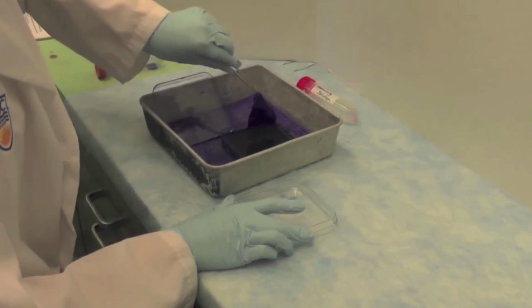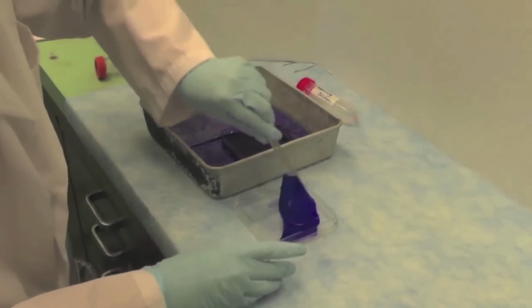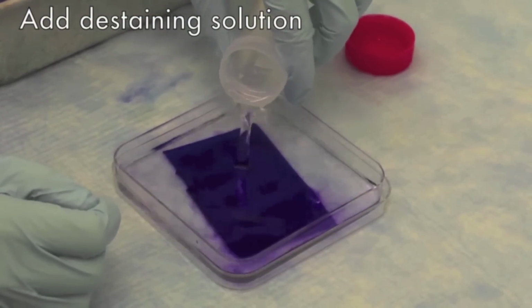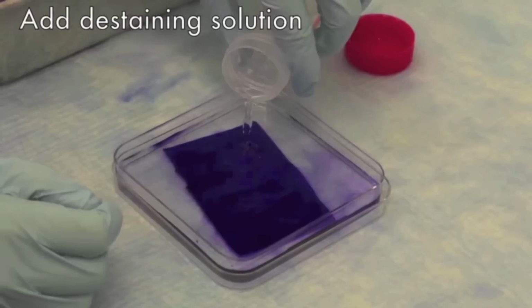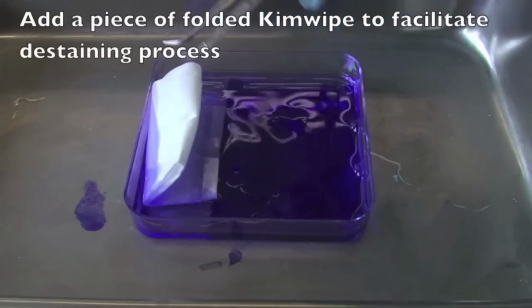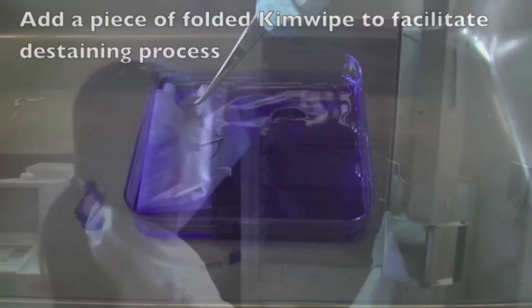Remove the gel with a tweezer and make sure you can observe clear bands on the gels before discarding the staining solution and replacing it with the destaining solution. When destaining, add a piece of Kimwipe or absorbent paper towel to help absorb the dye.